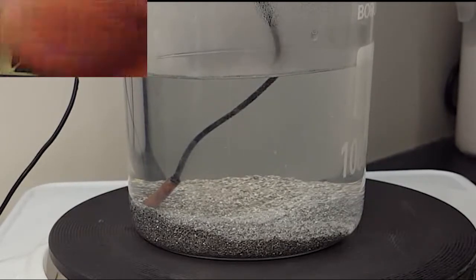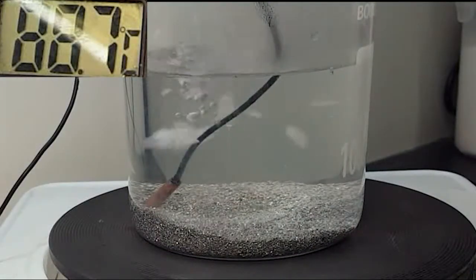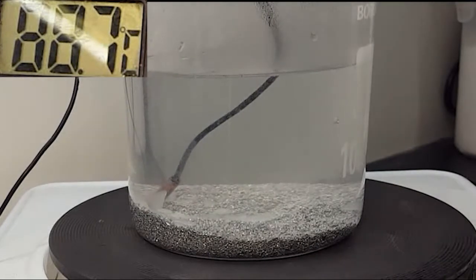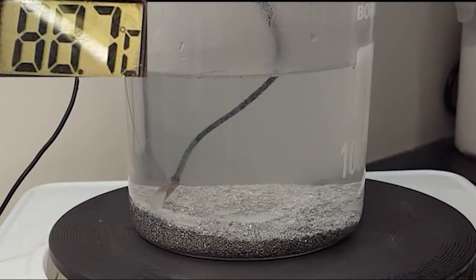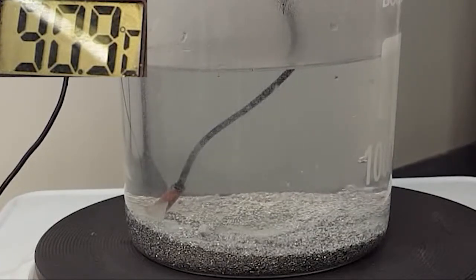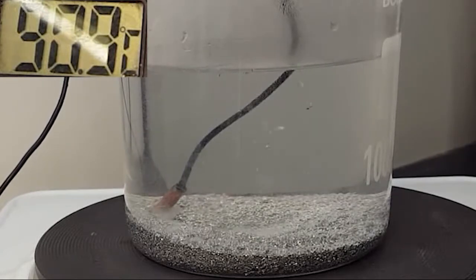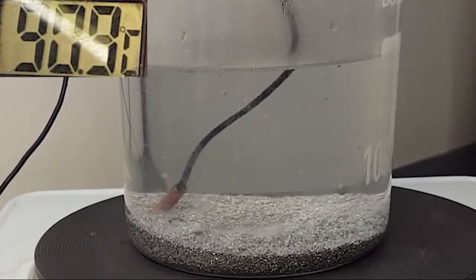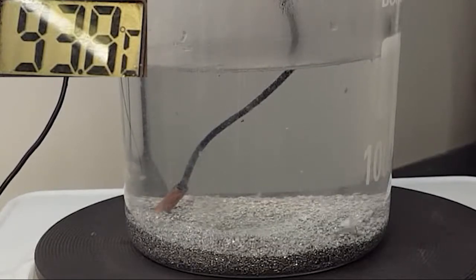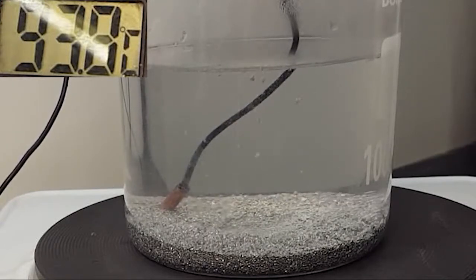There are just some little bits of air coming out of there. Now I'm going to add the catalyst which will soon dissolve into the solution.